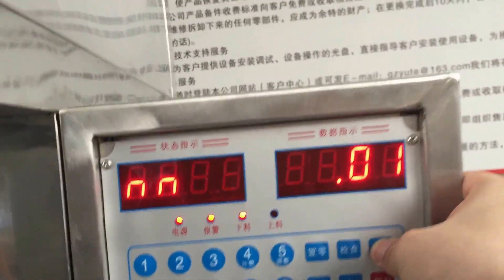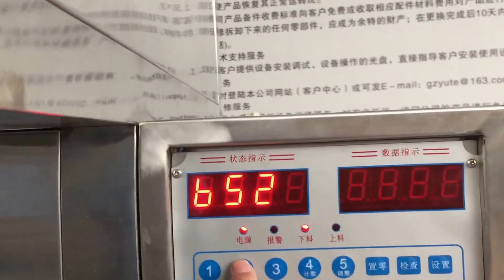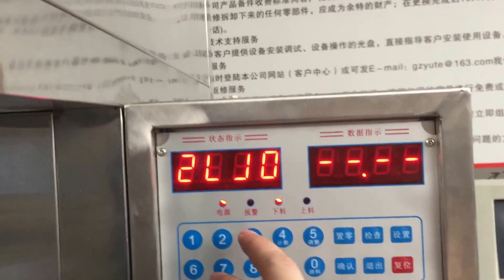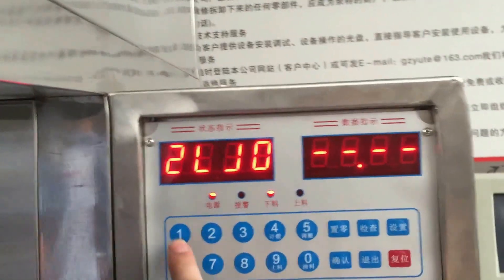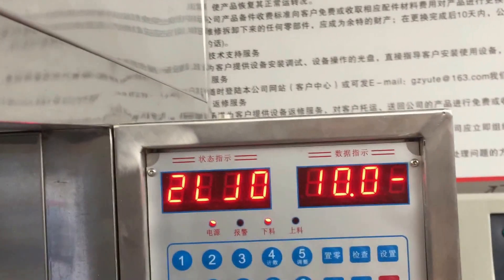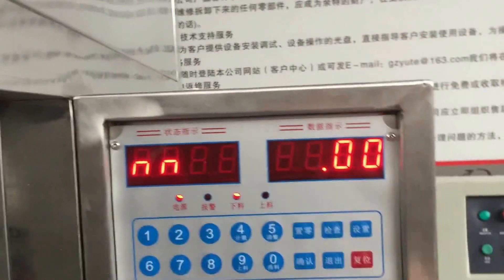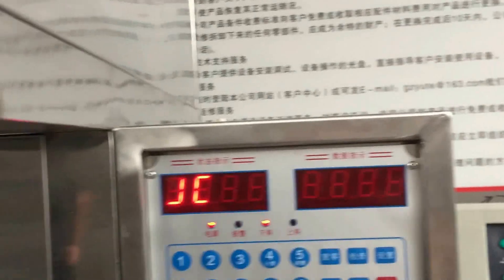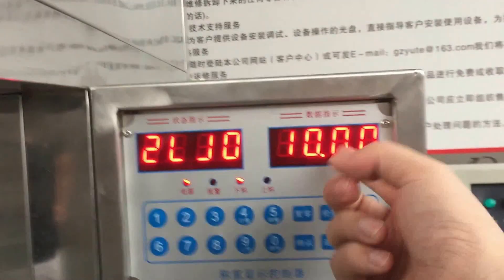Firstly, press set up and you can get this screen. Press two, zero. If you want to get 10 kilograms for every feeding volume, press one, zero, zero, zero. Now confirm. Let's inspect the feeding volume — press this and two. You can get 10 kilograms.